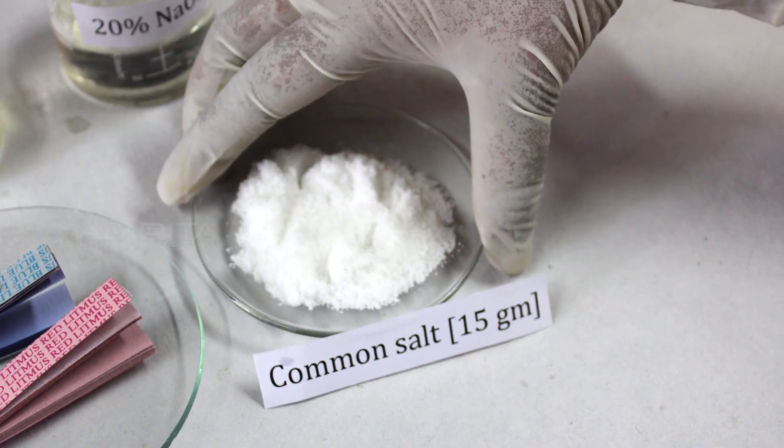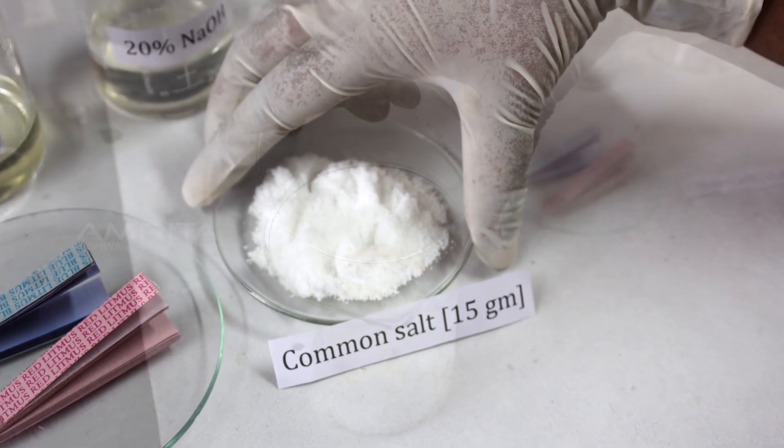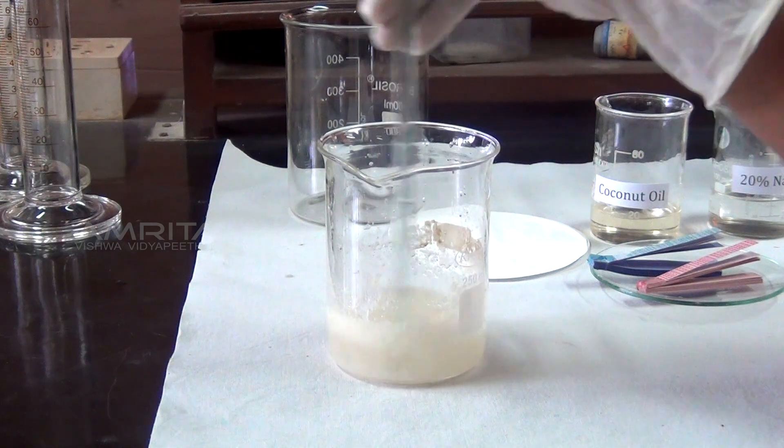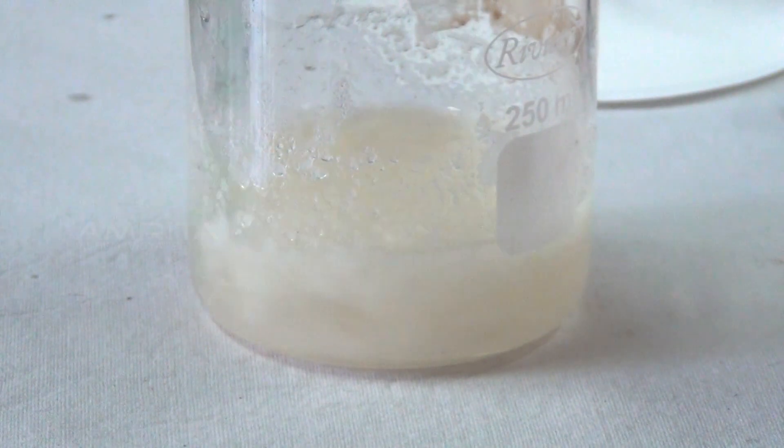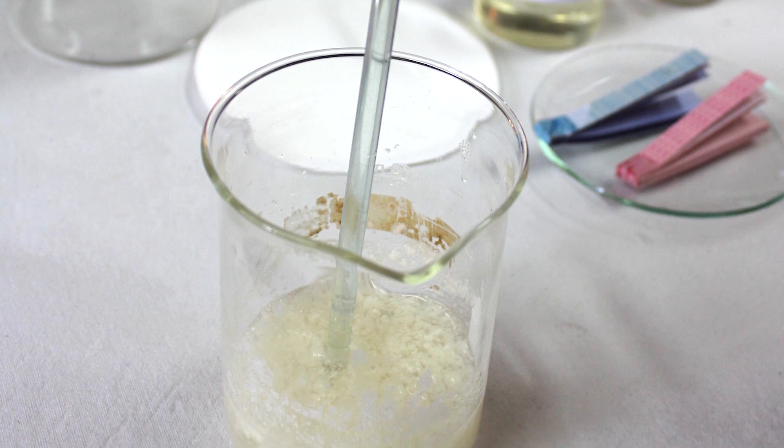Take 15g common salt and add it into the suspension and stir it well with a glass rod. After adding common salt, soap is precipitated out as a solid.